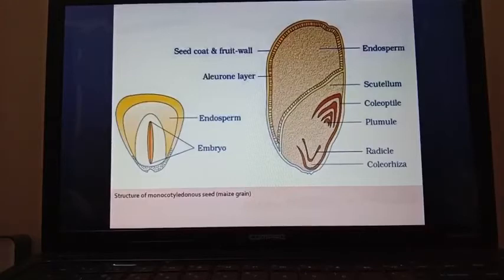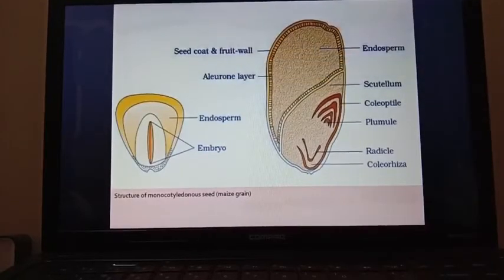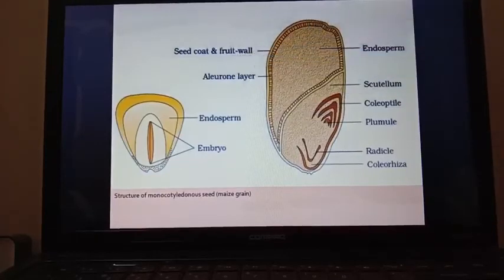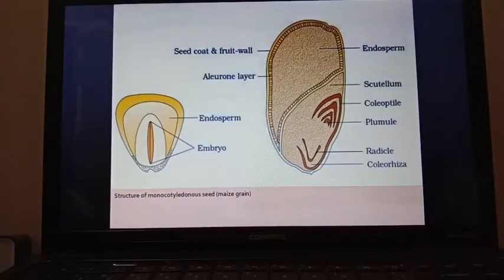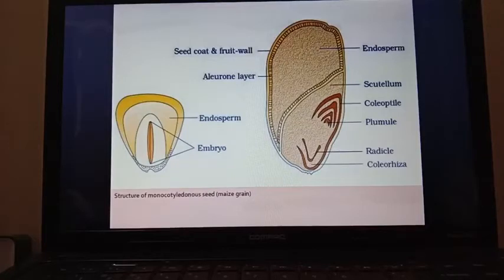One important layer present is the aleurone layer, which covers mainly the endosperm part. This aleurone layer mainly consists of cells which are capable of producing enzymes that are required during germination — very important enzymes.